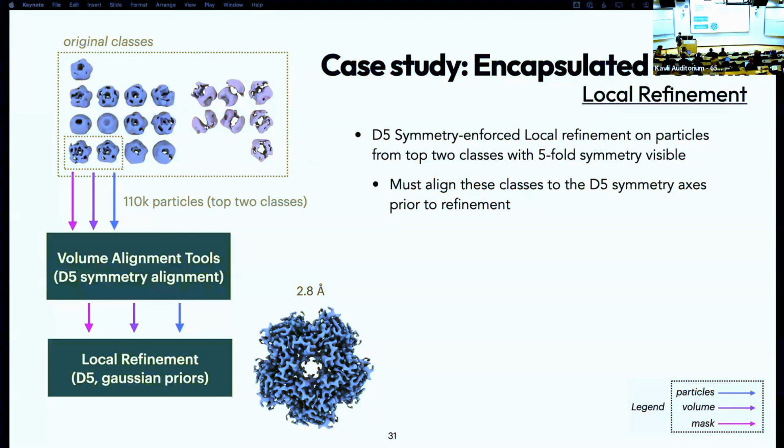I think another point that Michael raised early on that's worth reiterating is that a great thing about a data set like this is that right from the beginning, you know that the quality of the images is actually really good, because you're able to get the shell to a very high resolution without doing much. So you know that the actual exposures, motion correction, CTF estimation, all the other stuff that could have gone wrong is actually good. So now it's worth spending the time to figure out all the details of particle alignment, because if you were to do that well enough, there's a good chance you'll get a good structure, since the signal quality is actually really good in the images. Yeah, it's a great point.